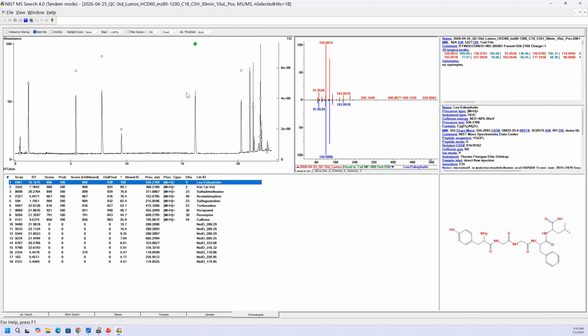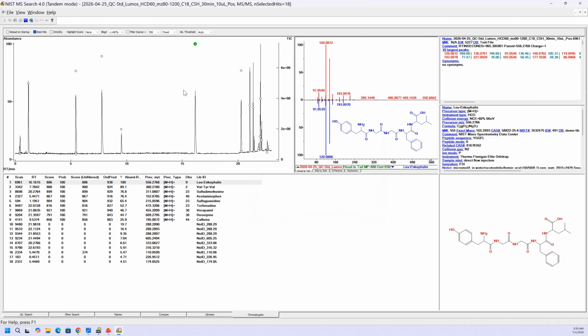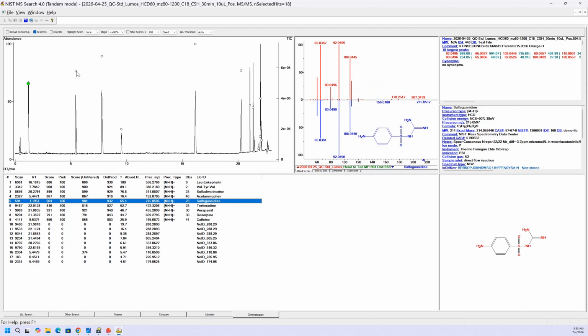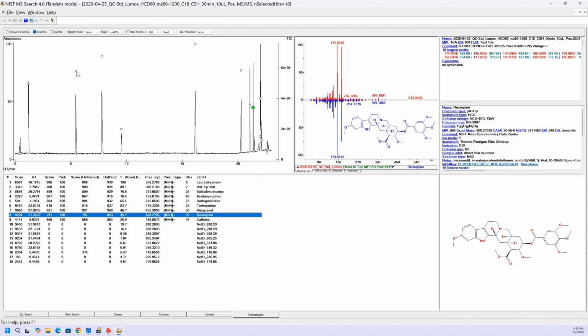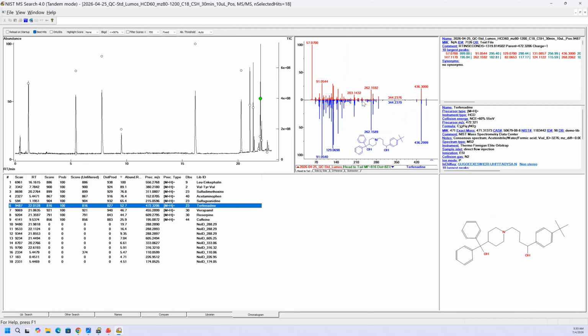So everything looks pretty good in the default settings, but I really like to have the structure displayed up here. So I will right click on it and go to properties. You can always go to the properties to change things, and I want the structure on the plot. For reviewing the data, as I'm stepping through it with the arrows here, I'll go back and step through with a couple of the arrows to see. I like seeing the structure directly under the known versus the unknown. And you're really just deciding if the data looks reasonable to you by reviewing it.